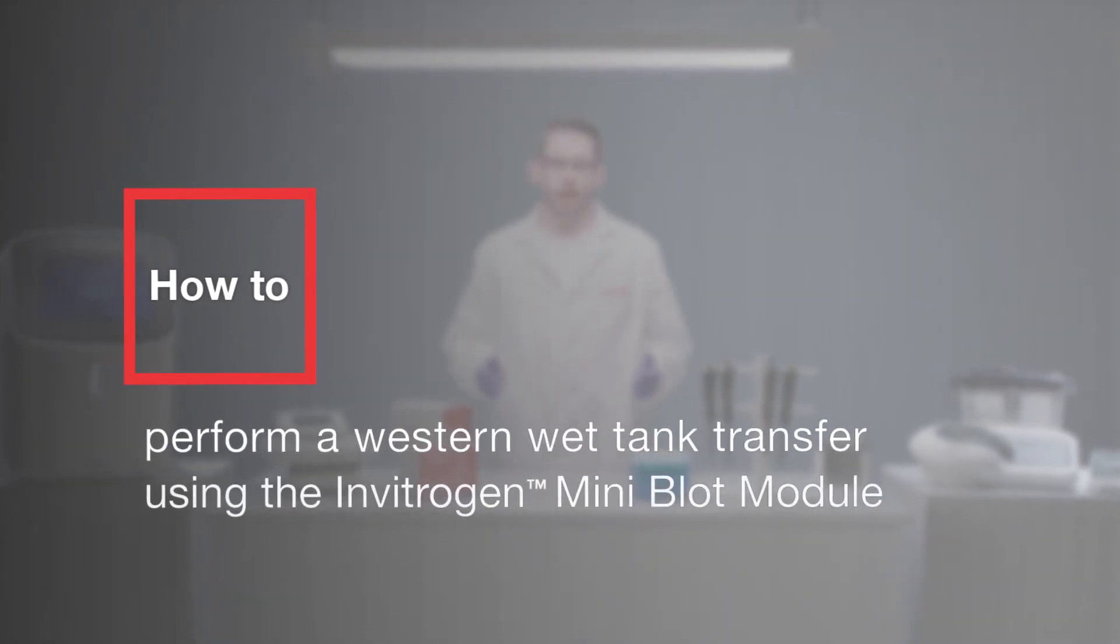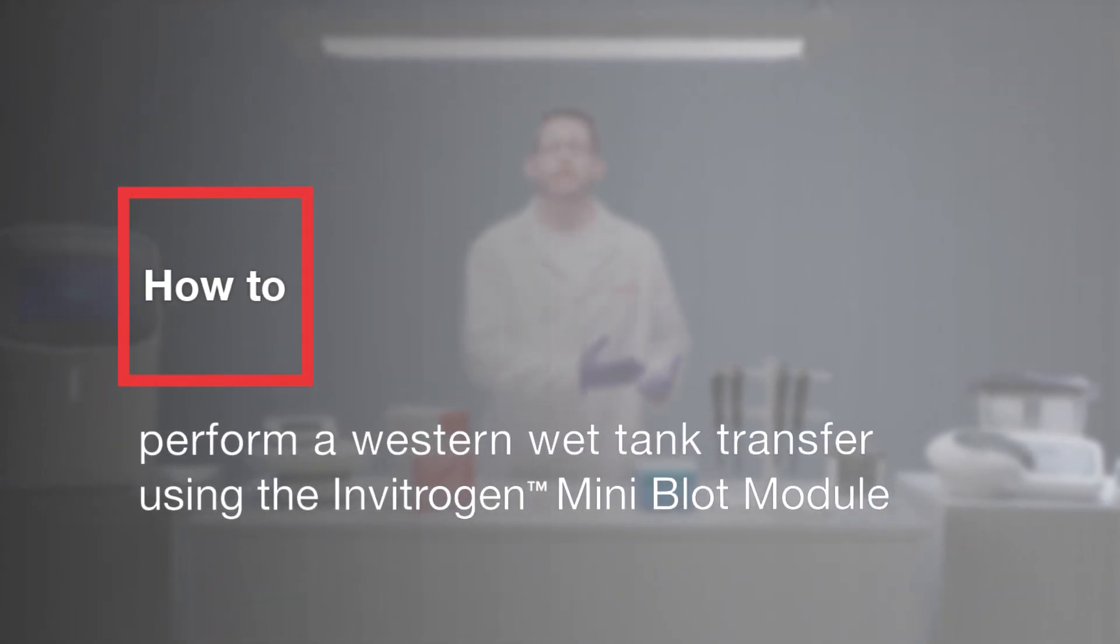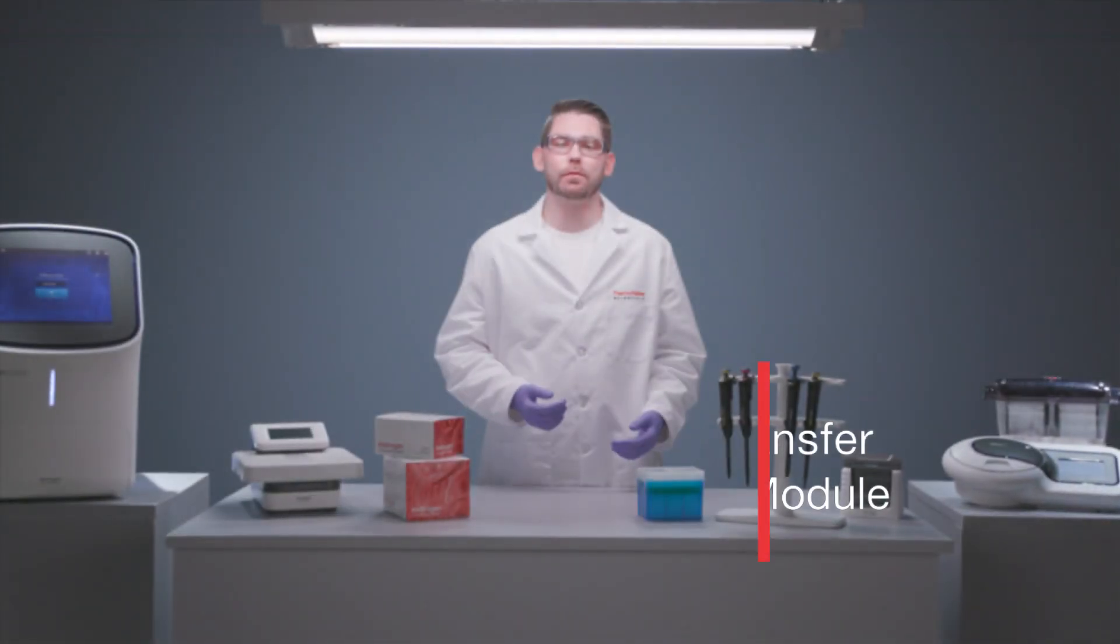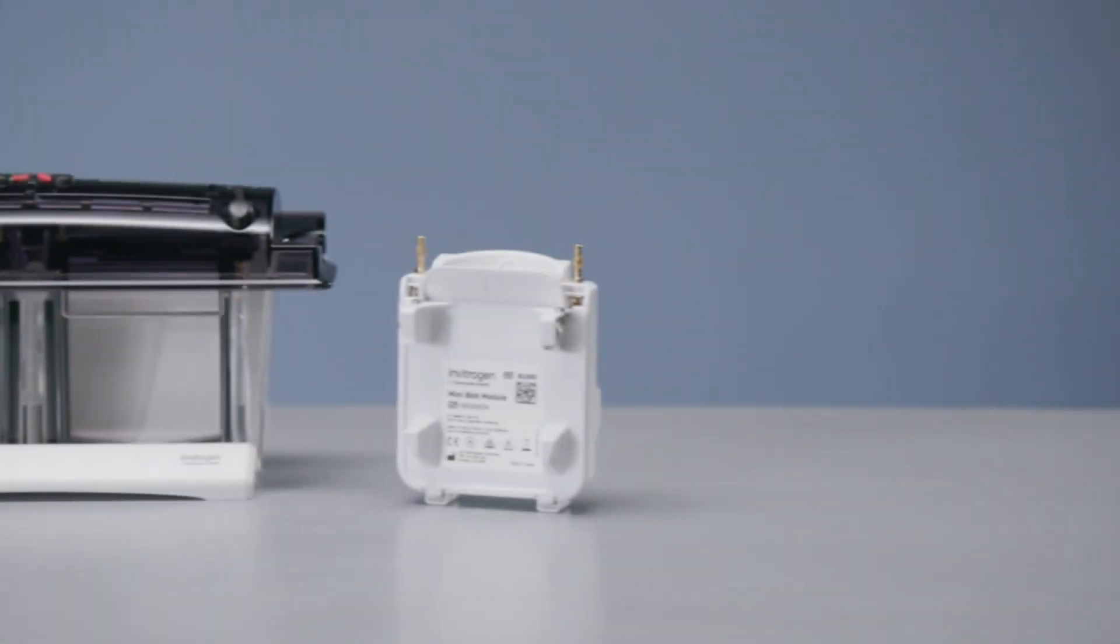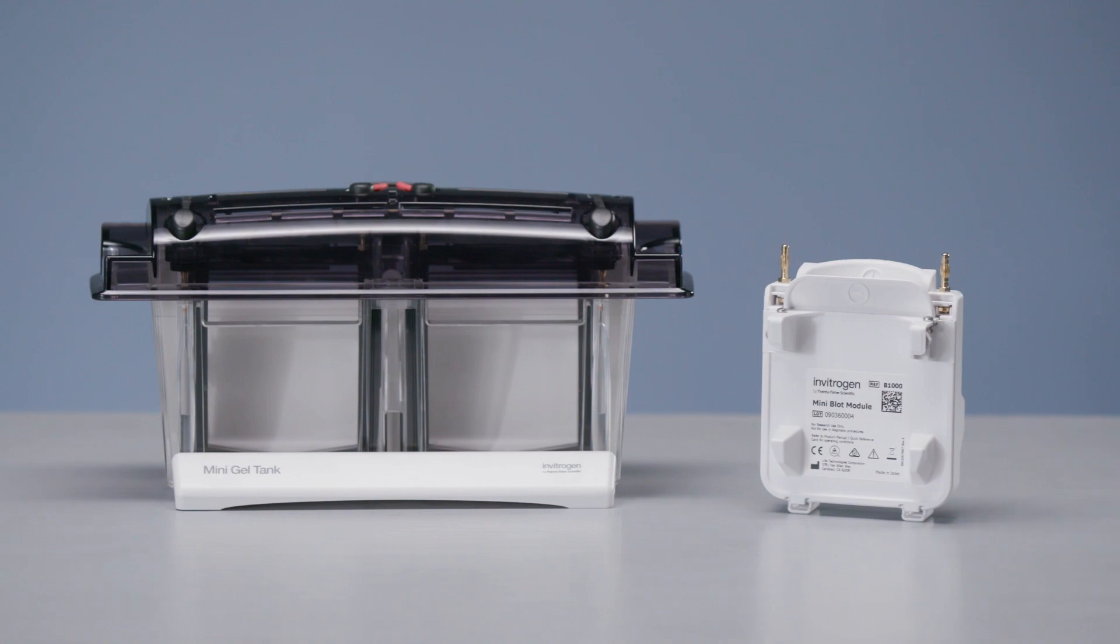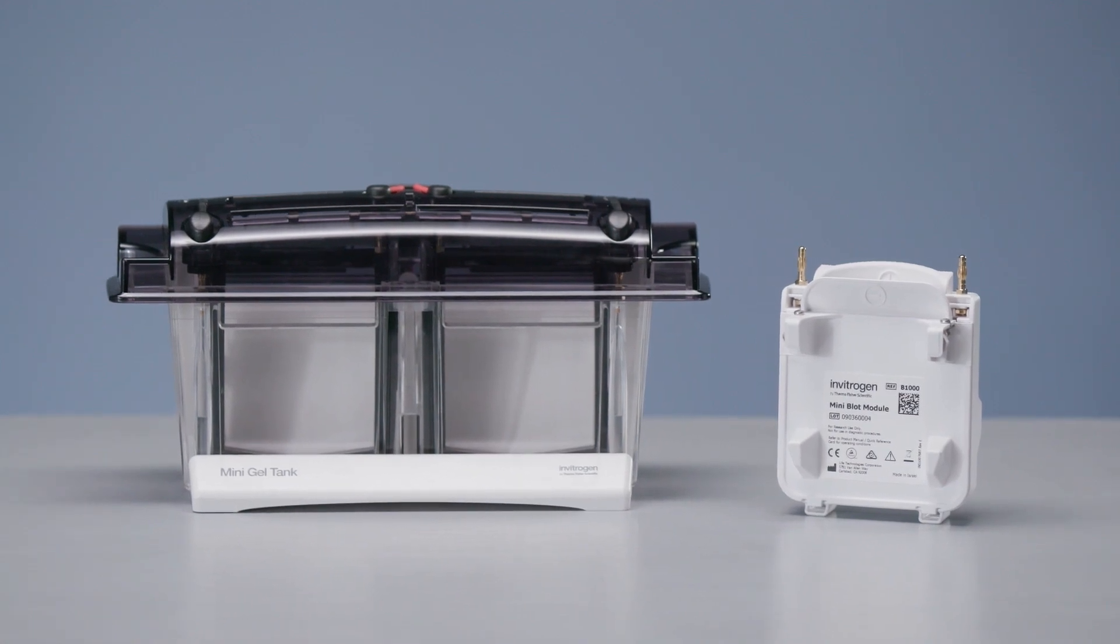Once the proteins have been separated in the gel, they can now be transferred to a solid support membrane to start the western blotting workflow. In this video, you'll learn how to perform a western transfer using the mini blot module in a mini gel tank.